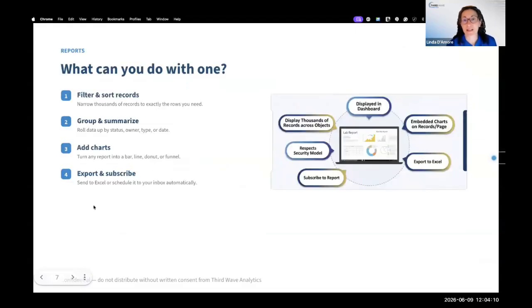What could you do? Well, usually you have generated a lot of data in your Lockbox, depending on how long you have been using Lockbox. Could be 100,000 or sometimes a million. So you could filter the records for what is of interest to you. You want to see the blood samples that arrived today, or the ones that were there in the last 3 years. You want to see which user has entered some information. You can report all of this really easily.